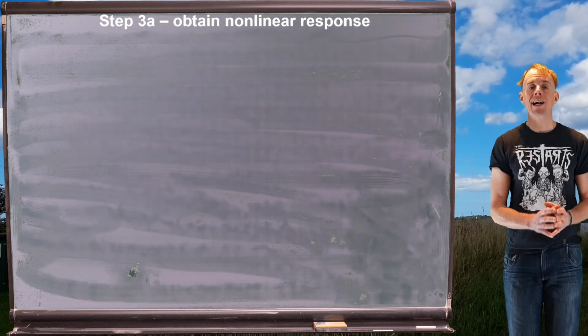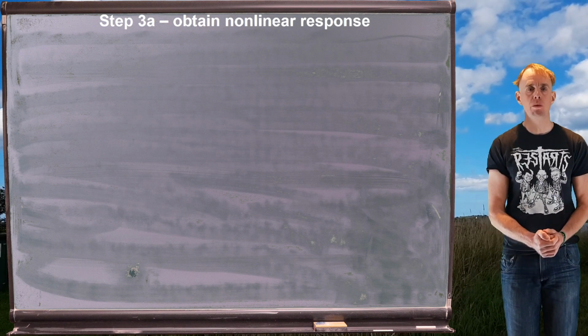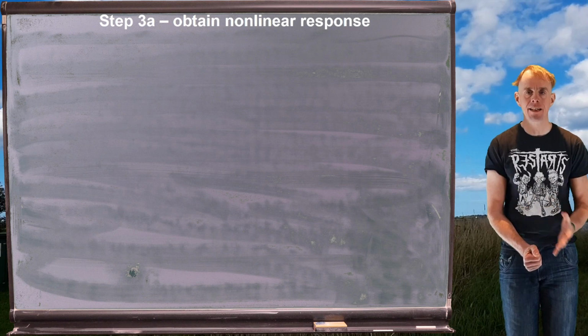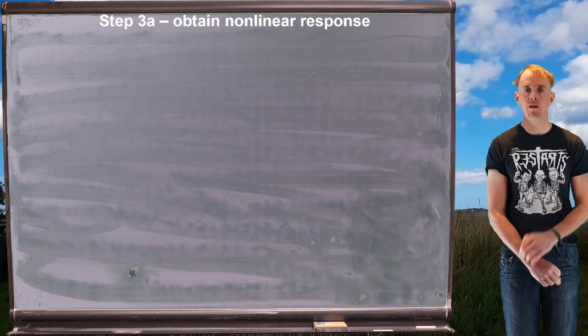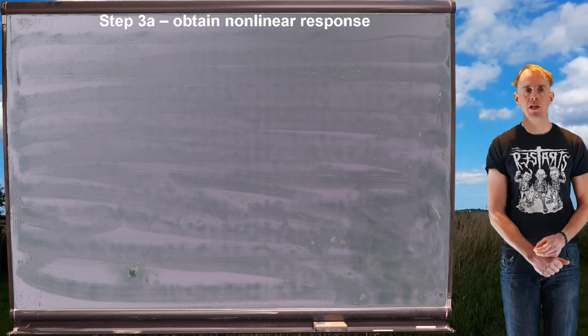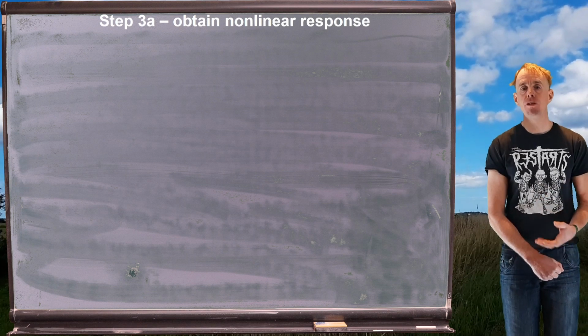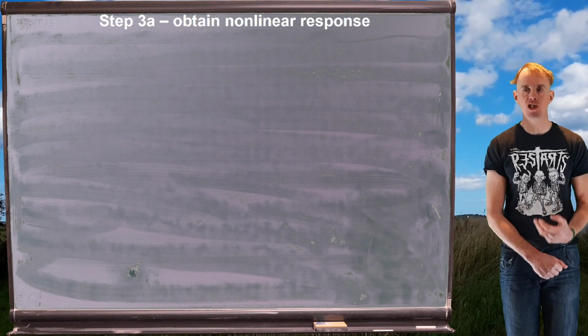So, we've looked at the linear viscoelastic region. We determined where that was using a strain sweep. We then did a frequency sweep at a linear strain to get us Gi and lambda i. Now we want to look at the non-linear part of the region. And we know that the nonlinearity of the polymer rheology gives us a phenomenon like shear thinning in steady shear.